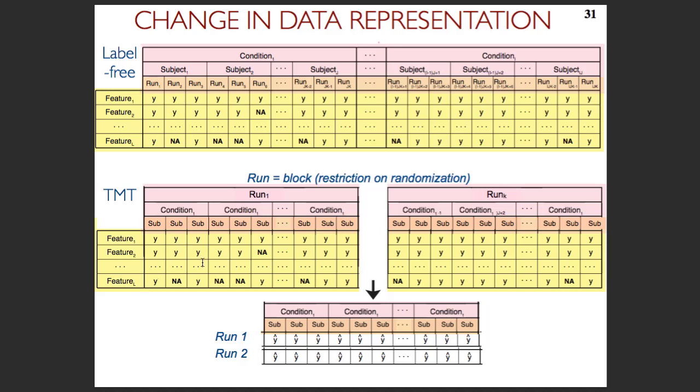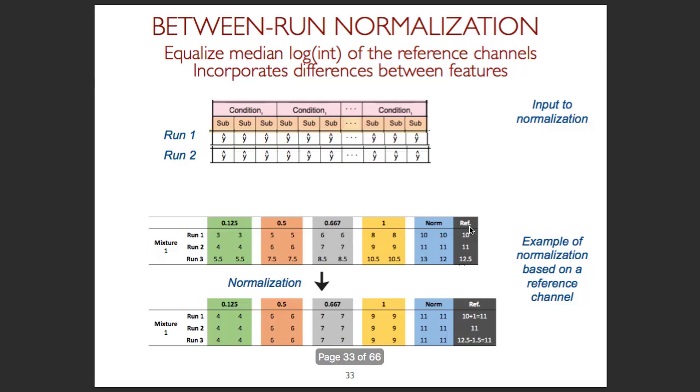We go straight for summarization here. But then we have multiple runs, and this is where we need normalization. The way we set it up was that we first have one summary per run across multiple ions, or multiple MS spectra, which were produced within this run. And then we normalize these summaries. I think this is a better way to do it, in part because the summaries are more reliable than individual ions, right? And so those will be normalized between the runs.